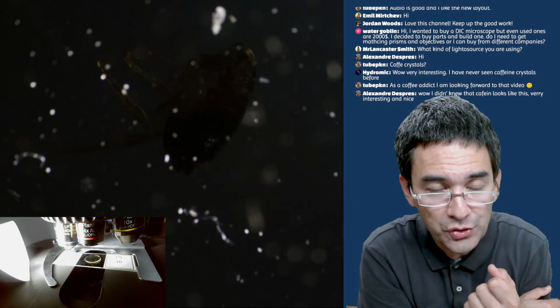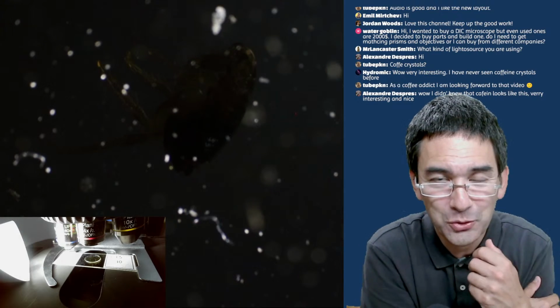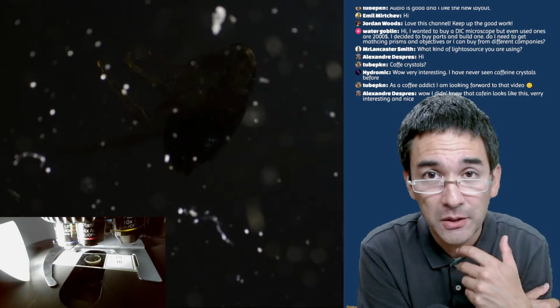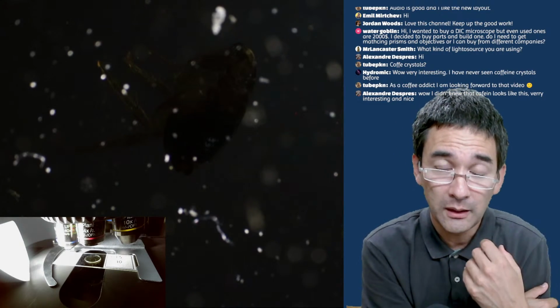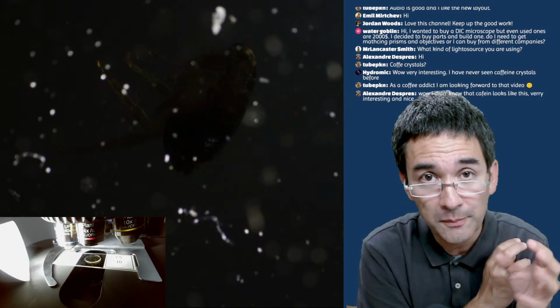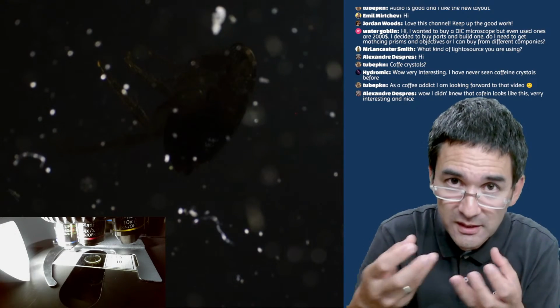This basically shows you that not all specimens obviously are suitable, and you have to make sure that you have an opaque specimen. Now, why am I saying this? Because I recently got an email from someone who wanted to build his own microscope for research and so on. And he said he has some problems fitting a light source beneath the specimen.